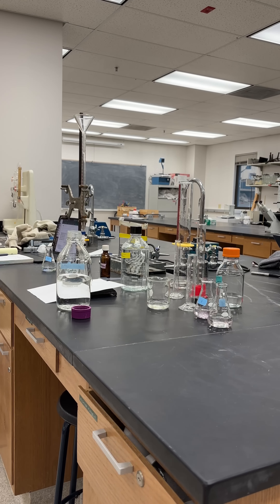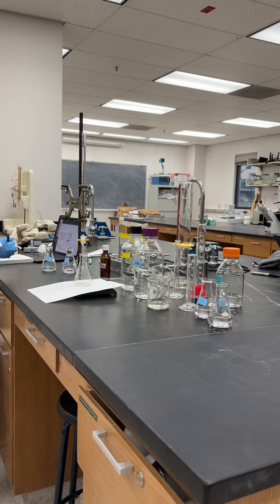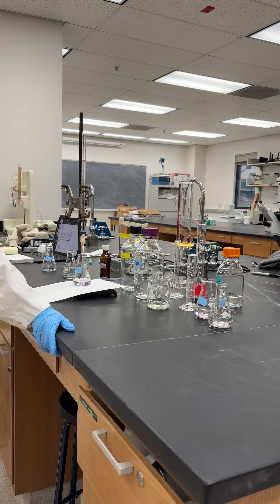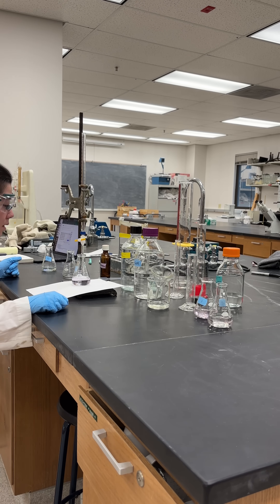Here is me performing a titration. At this point I had already run the titration multiple times, so I knew about where the endpoint I was going for was. We got it turning hot pink and then disappearing to clear, and I got it to an endpoint that was a beautiful light pink.